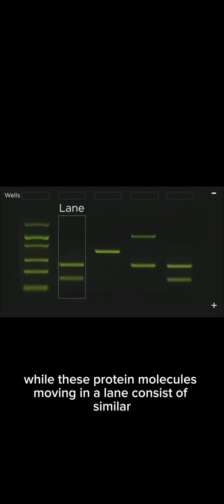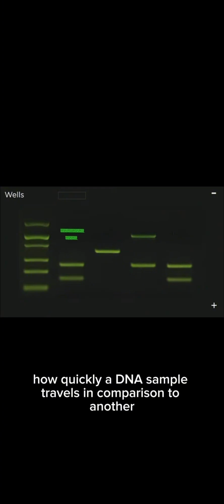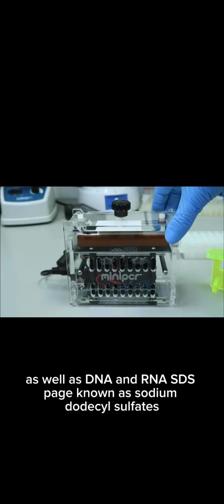While these protein molecules moving in a lane consist of similar packed molecules of the same size and speed, called a band, often in a straight line. How quickly a DNA sample travels in comparison to another lets us know how big they are compared to one another. For example, the protein molecules in band A have moved faster than the protein molecules in band B. Therefore, the molecules in A are smaller than those in band B. Agarose gel electrophoresis helps us in molecular biology, allowing us to visualize and understand protein molecules as well as DNA and RNA.